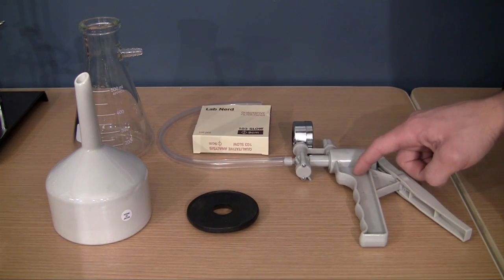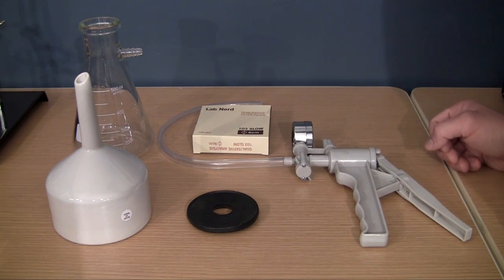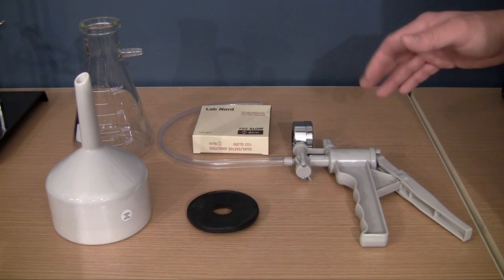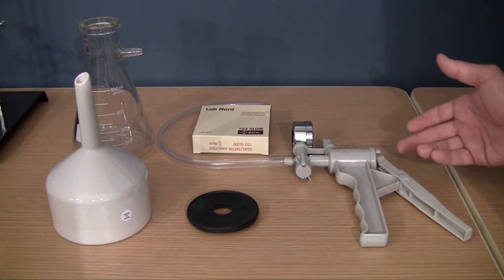Aside from that, you have your vacuum pump. I have a hand pump because I really don't do a lot of filtering, so I can just do mine by hand. But other systems, more complex systems, are actually built right into the lab, like whenever you go to college or anything. But mine is just a simple hand pump.